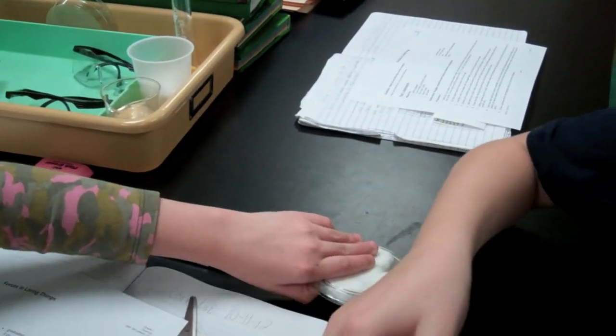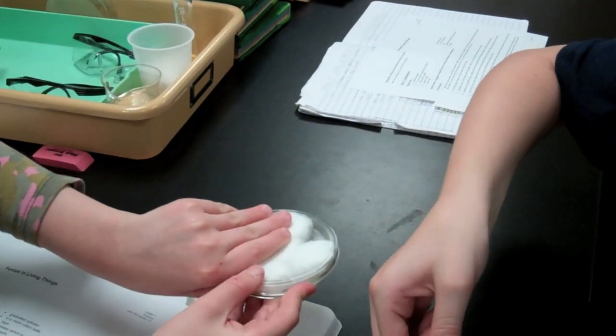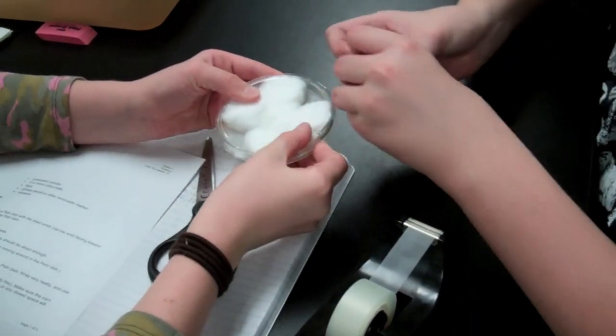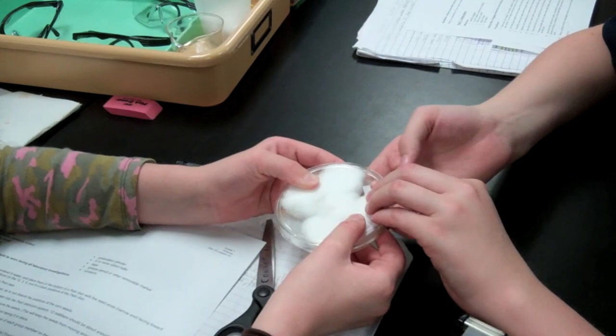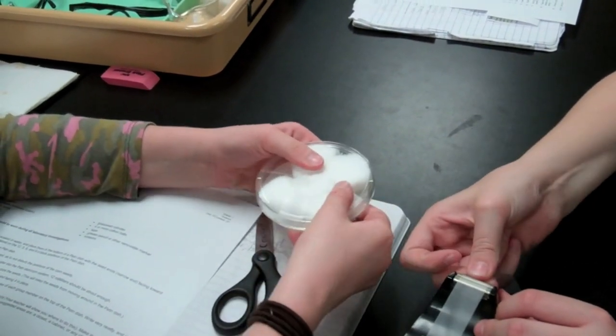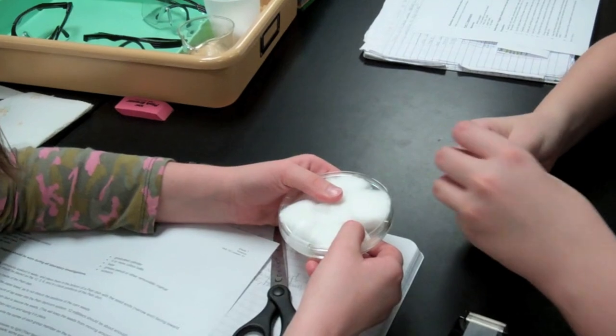After placing the cotton balls, we simply place the back side of the petri dish onto the front. This will allow the petri dish to stay secure as it stays in a vertical position in the cabinet. Simply take scotch tape and tape it around the outside edge, keeping the front side and back side securely in place.